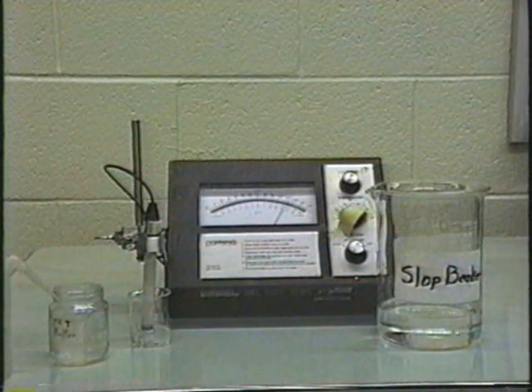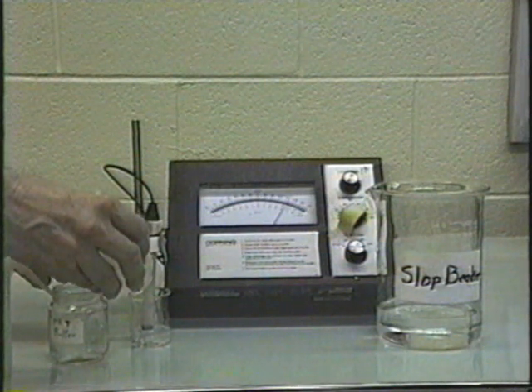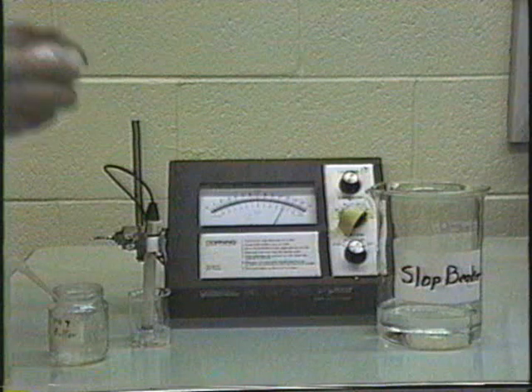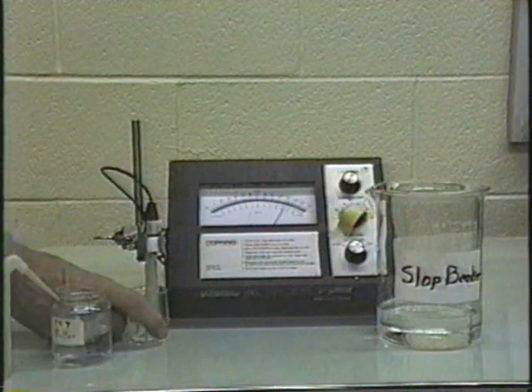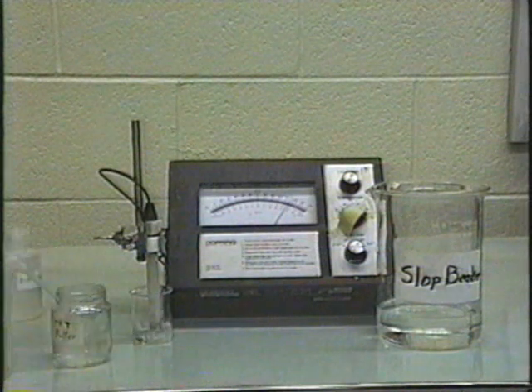Now, if we want to add something to this solution, we can do that. I'll just add some more drops of sodium hydroxide to this. And without changing it from the pH reading or anything else, just swirl it and take another reading.